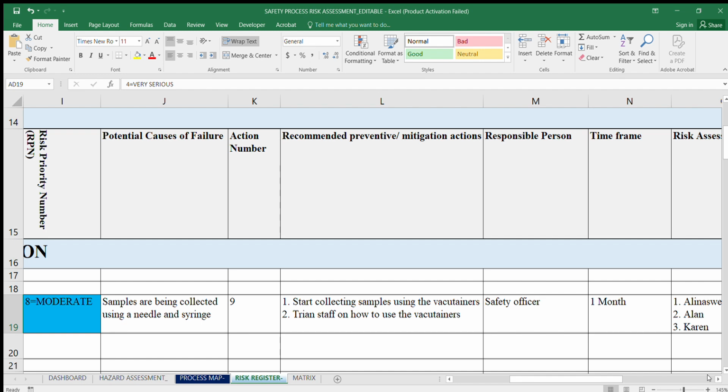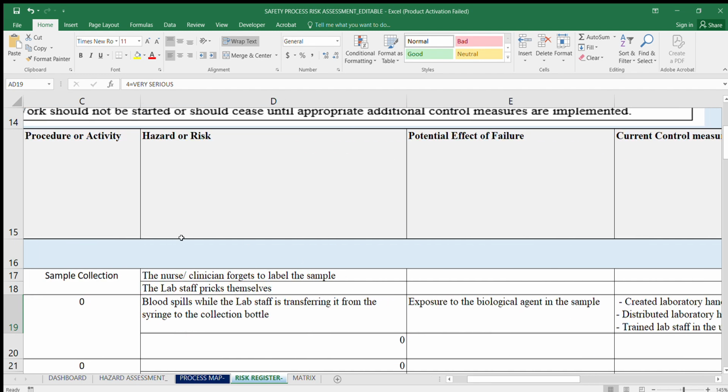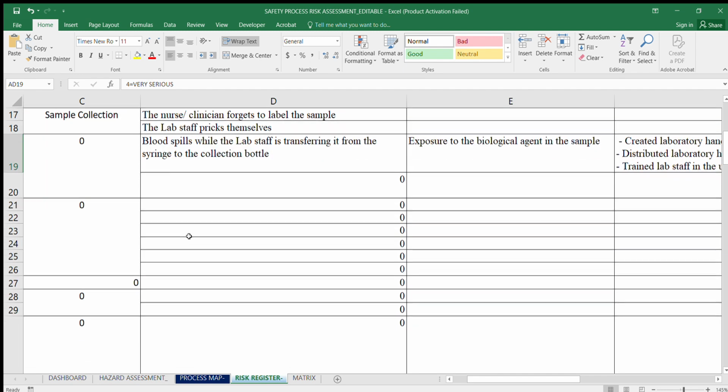So there are certain moments when the risk even increases after you do the review, but there are certain instances where maybe after your initial review, the risk will reduce to acceptable ranges. So you need to do this for all your identified risks in the process. So I'll just give this one example since I've explained it all the way to the end.